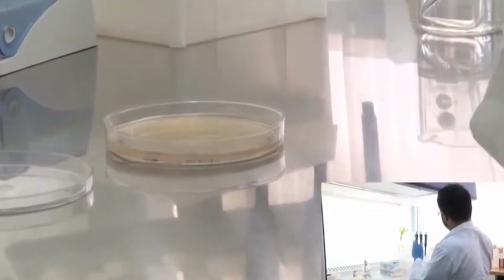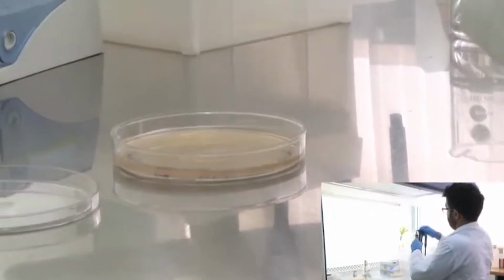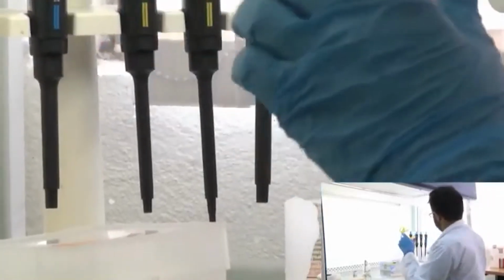Keep it in the center of the plate, release the pipette quickly. You need to be a bit fast in this sort of work, but it's nothing to worry about. With practice you are going to get there eventually.